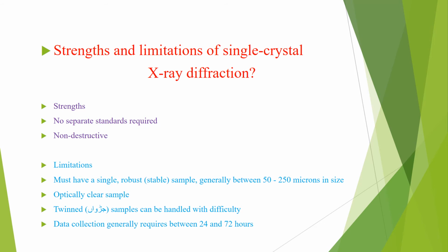And when we move on towards the limitations, it must have a single robust stable sample, generally between 50 to 250 microns in size.